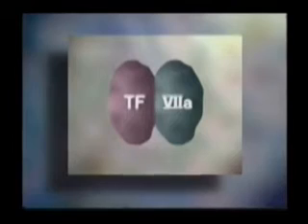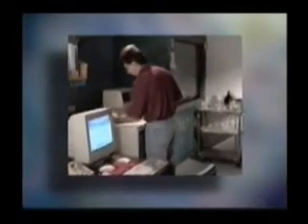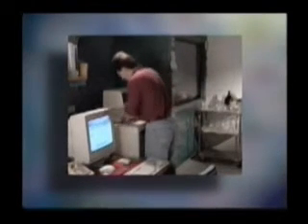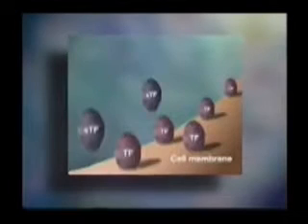We'll begin with a look at two proteins whose association triggers the blood clotting process. Using a laboratory technique called SDS polyacrylamide gel electrophoresis, we'll determine the molecular weights of these proteins. Next, another technique called analytical ultracentrifugation will help us characterize the way these proteins combine. Finally, what we've learned about the structure of this protein complex suggests strategies for keeping inappropriate initiation of the clotting cascade in check.